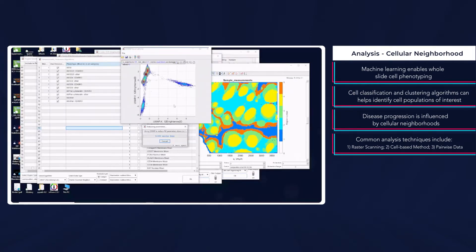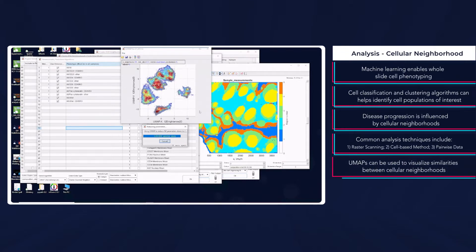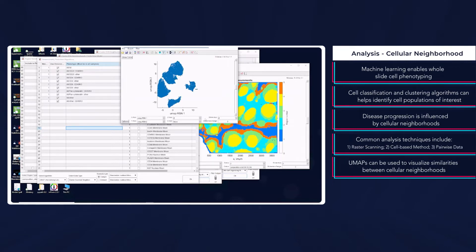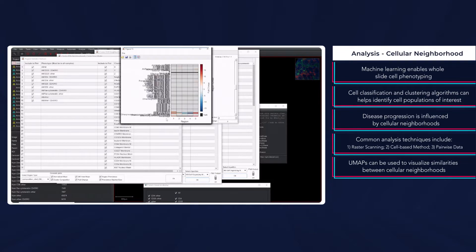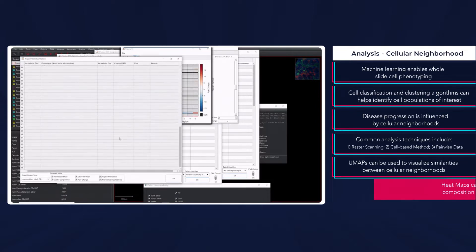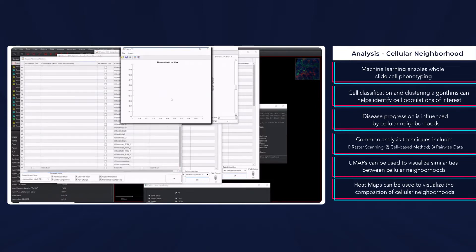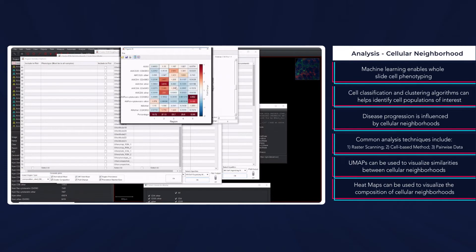To better understand how cellular neighborhoods interact and communicate, several techniques are available. One being UMAPS, which is a dimensionality reduction technique that shows the co-localization of cells and indicates the similarities between cellular neighborhoods. Another is heat maps, which show the composition of cellular neighborhoods.